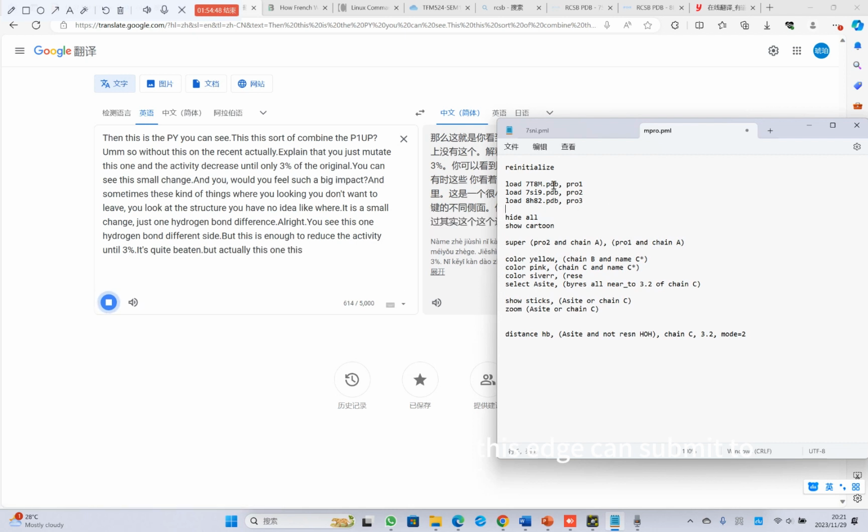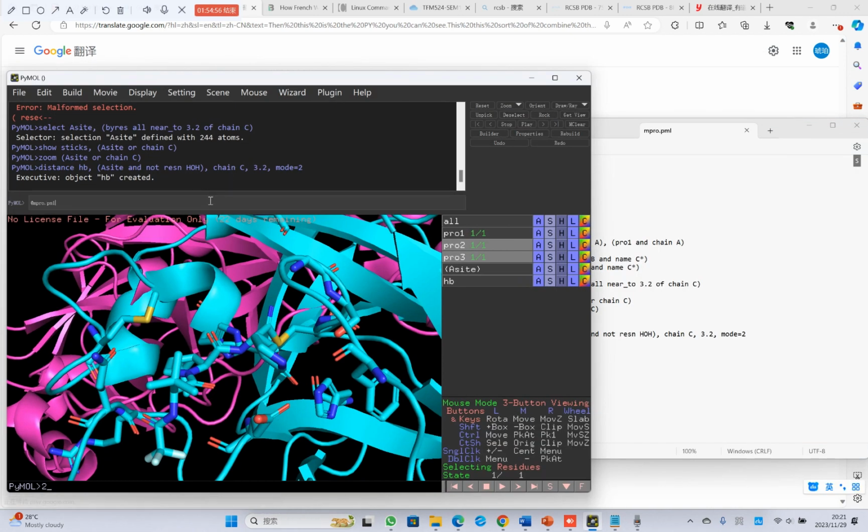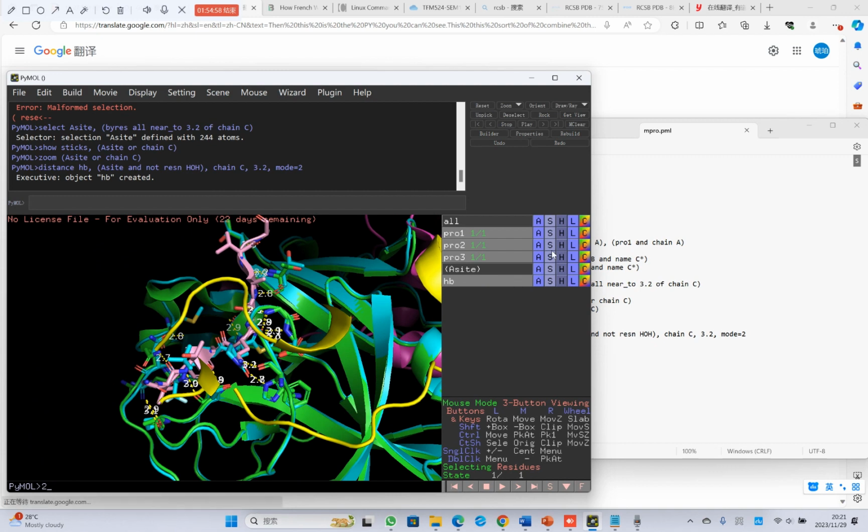This forms a dimer. This can also bind to another monomer. Okay, so for this lesson, you just need to write a report.